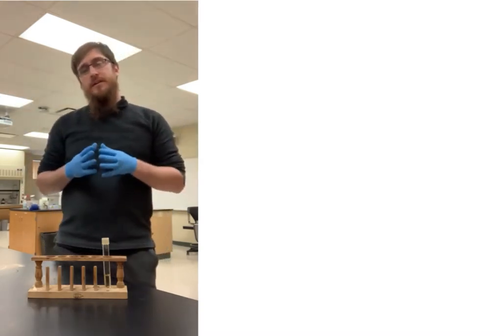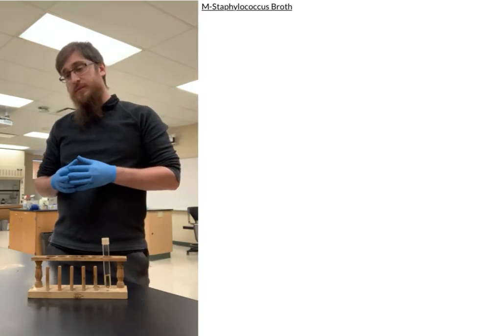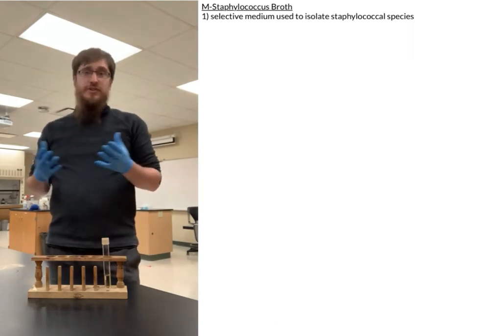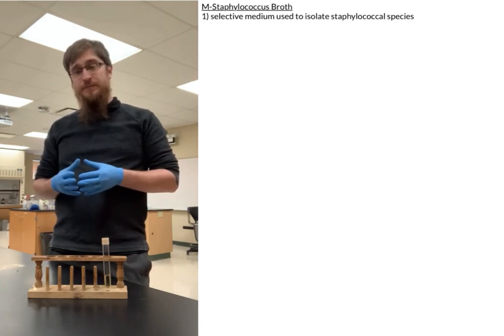Hey everybody! Today we're going to be talking about the M-Staphylococcal broth that we're going to be using in our lab. The M-Staphylococcal broth is a selective medium that is generally used to isolate different types of Staphylococcal species.